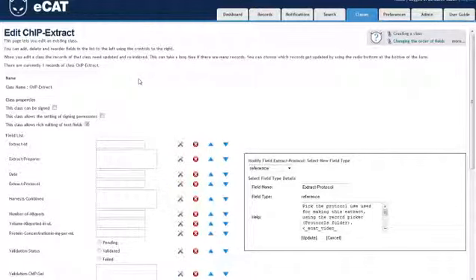Flexibility. That's the key point, really. No software can know how an individual lab wants to run experiments or organize its data. Everyone is different. eCAT lets you build the exact structure your lab needs to store your data in the way that works best for you.